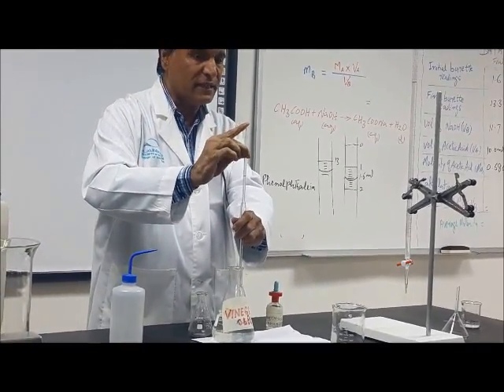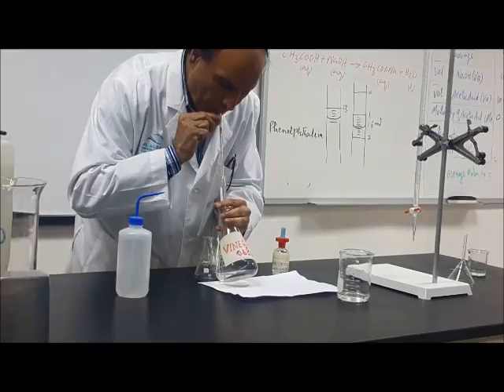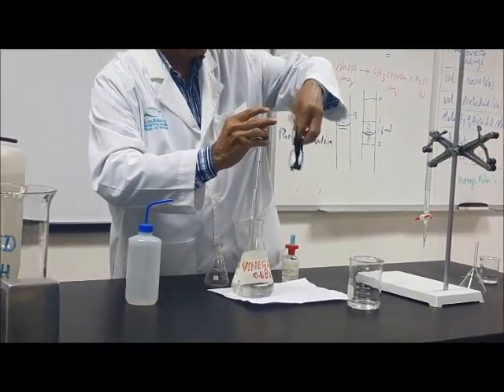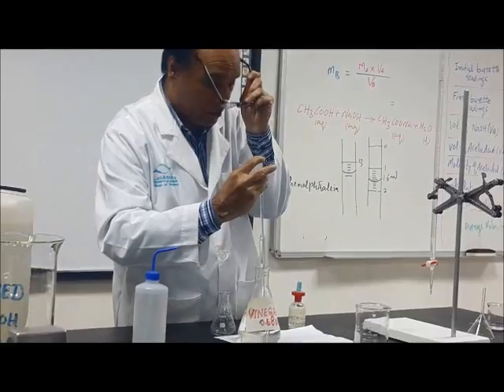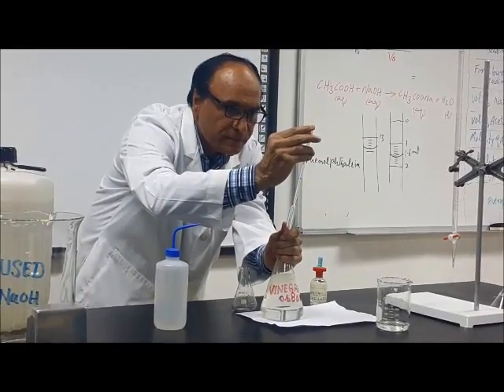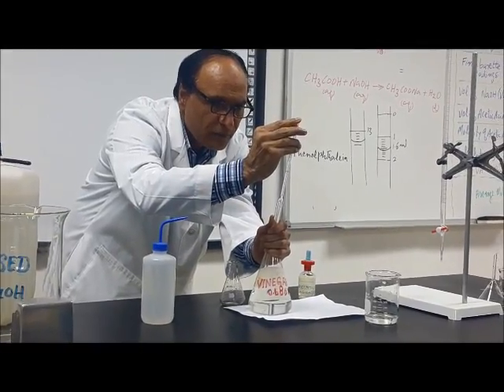Okay? And when you do it, it will take a certain time, and you should be doing it carefully. Do you see it is going down? Yeah.